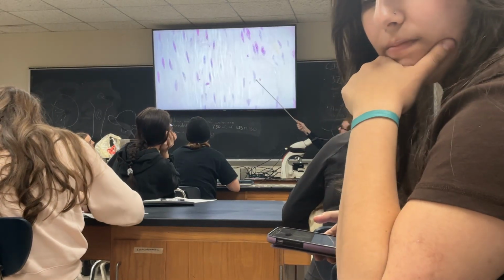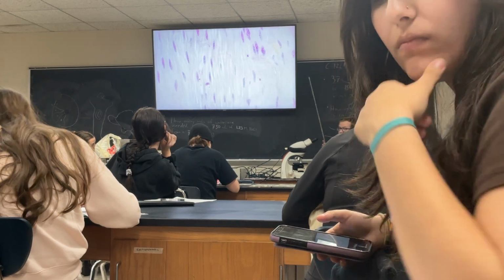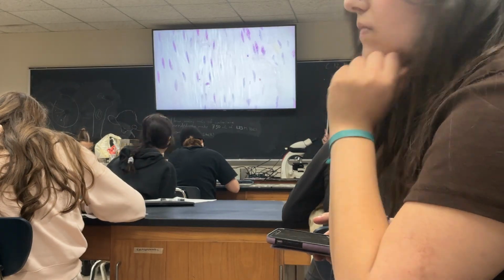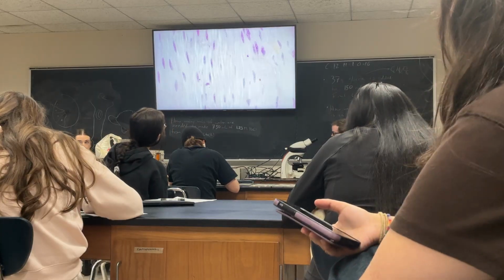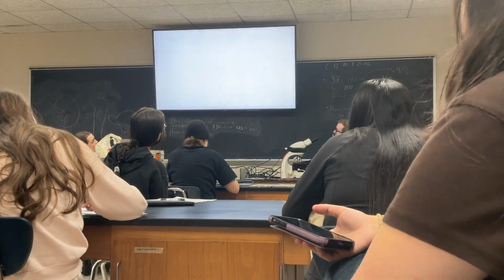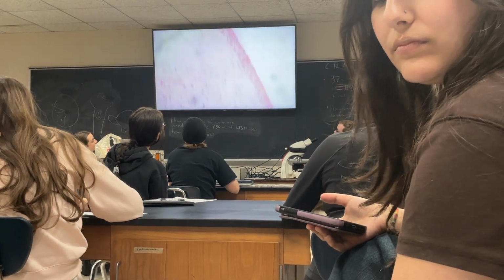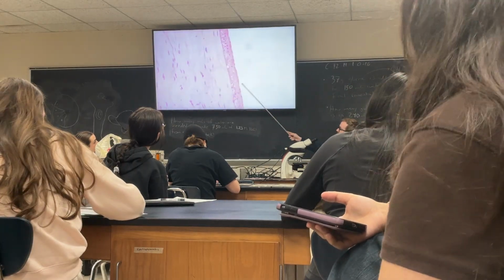These nuclei, I can even see the nucleolus, which means they're not crushed completely flat. They're squished. Fusiform is the term for smooth muscle. But they're not flattened like if this was dense regular connective tissue. So, tons of cells. This is smooth muscle. This is also smooth muscle.